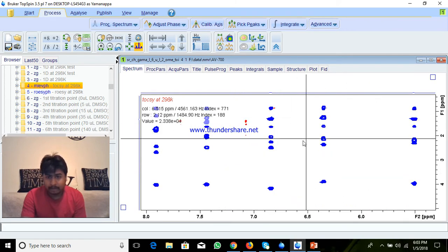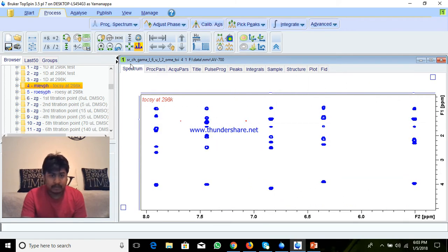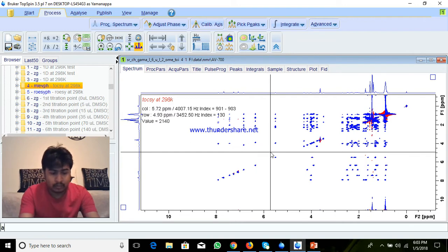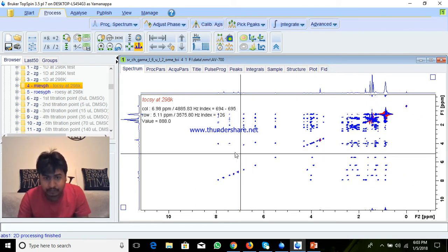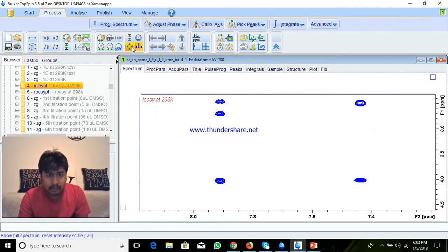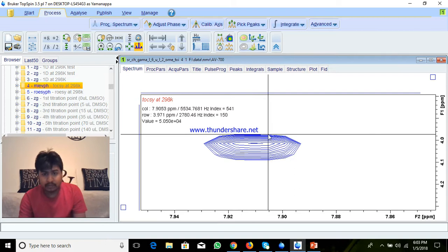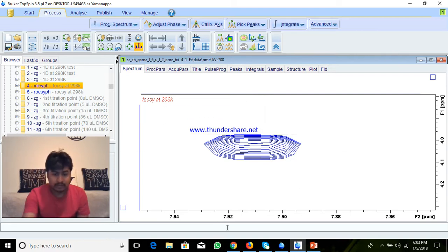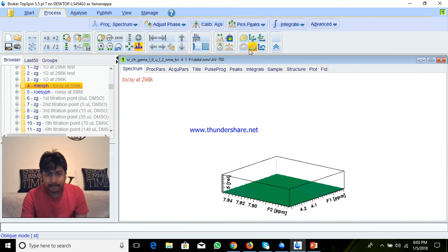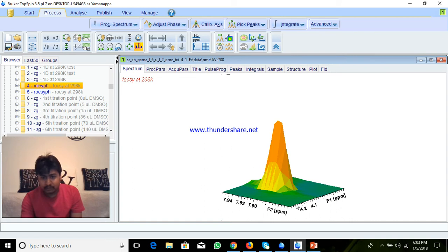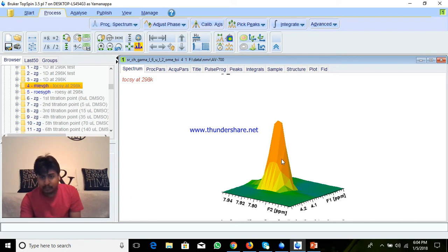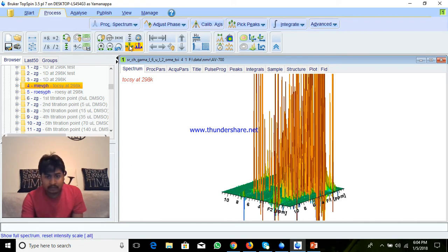Now you have a nice spectra. Do abs1 for baseline correction on the second axis, and abs1 for baseline correction on the first axis. Another thing — the peak shape sometimes you will get this because if you give a number of levels, this is a 2D contour — this is also proton, this side also proton. This contour, how many slices you make, depends on that you will get the proper shape.